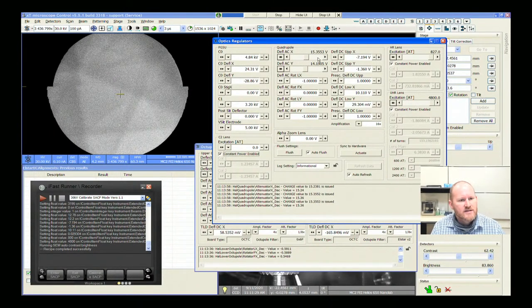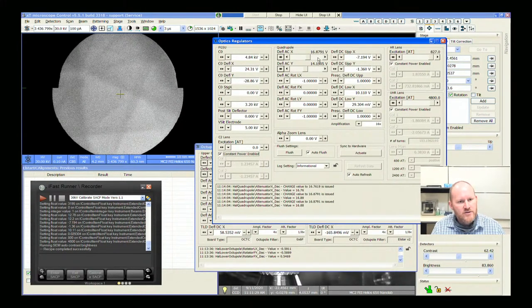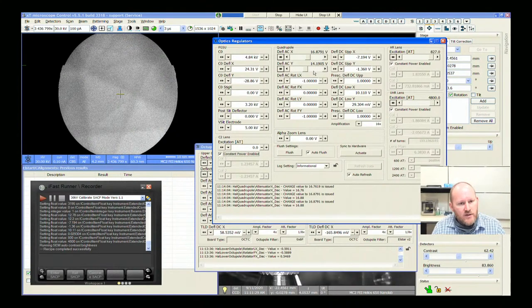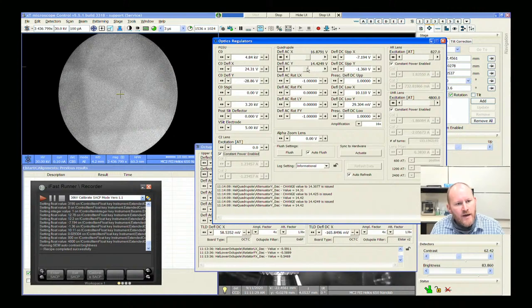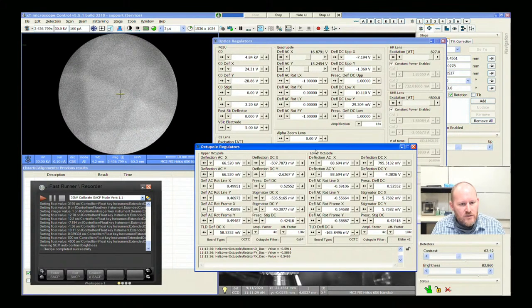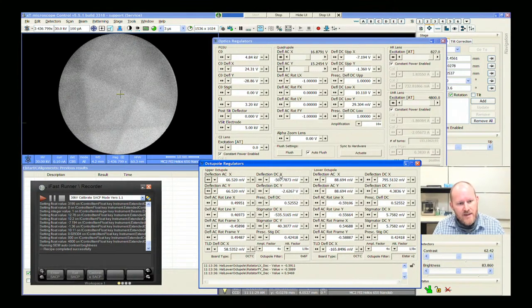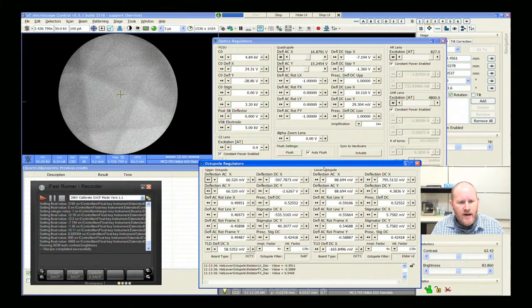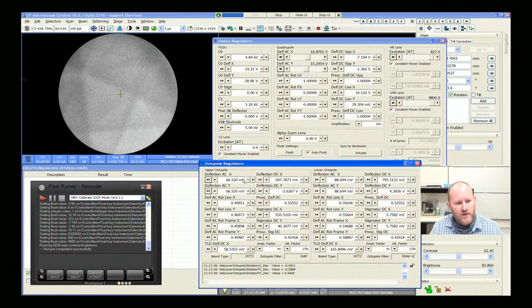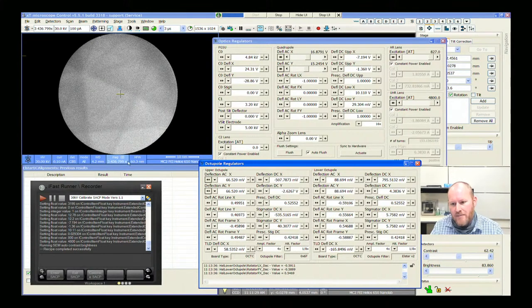I want to show entering and exiting SACP mode and then I'll start to build the patterns from scratch, so you can see exactly how I go through all of these optics regulators. The deflection AC X and deflection AC Y on the quadrupole — this is effectively your gun tilt and shift. The octopoles are the scanning plates: AC means a sine wave back and forth, DC is a beam shift. So AC is the amount of voltage we're applying to scan the beam; DC is the amount of voltage we're applying to shift the beam.